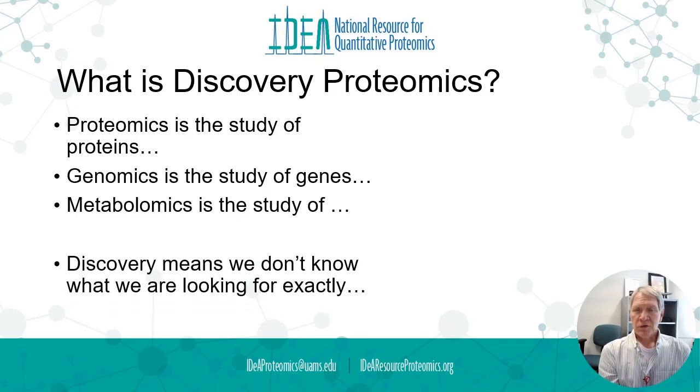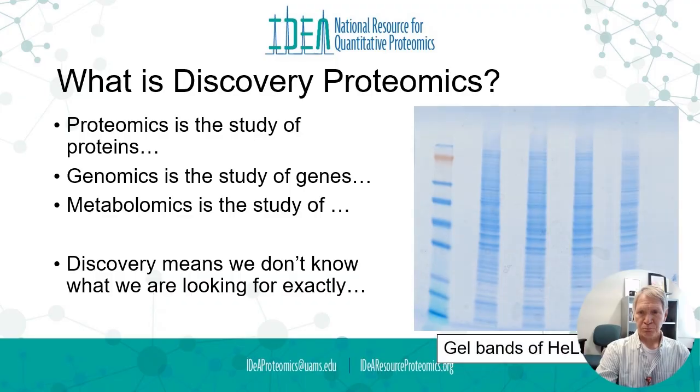If you put discovery in front of that, that means we don't know exactly what we're looking for. We've designed some sort of experiment to cause a change in the proteome, but we're not exactly sure what's going to happen as a result of that. We're not looking at just one protein or one set of proteins. We want to see how this change affects the proteome globally.